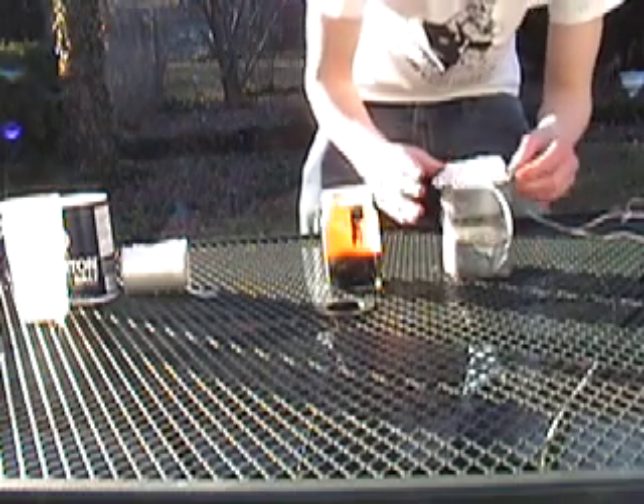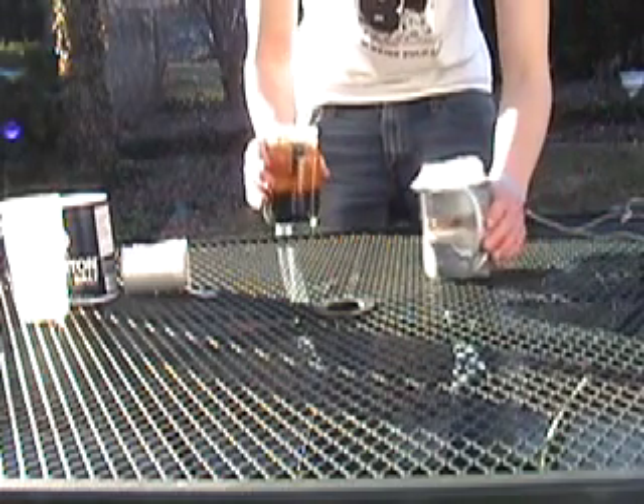Now it's secured. You're just going to pour it in there.